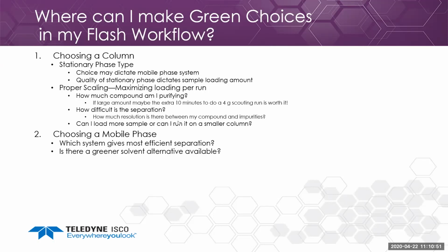Is there a greener solvent available? And then which system gives me the most efficient separation?